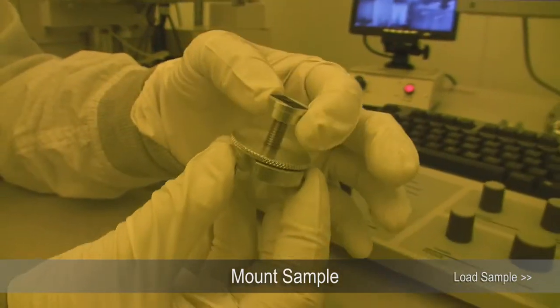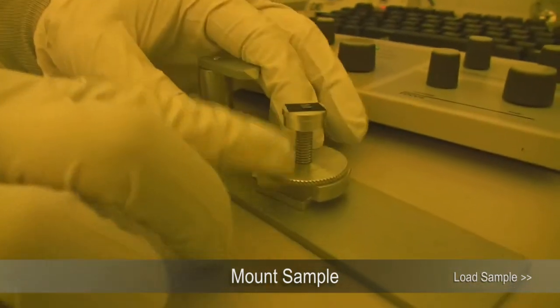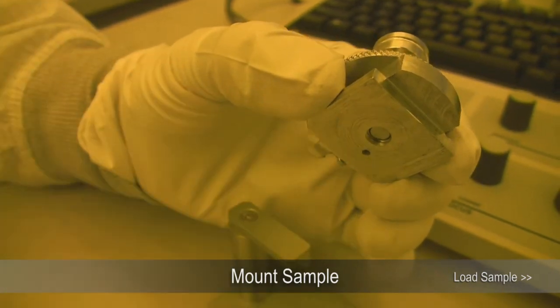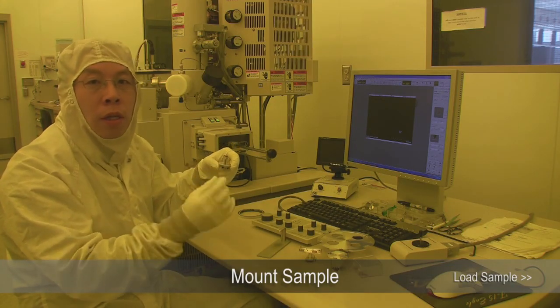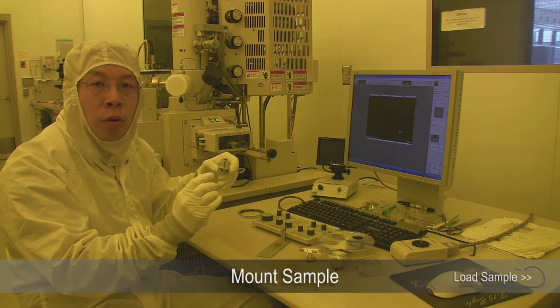So you loosen this set screw and then turn it back up counterclockwise — it will be very stable because it doesn't stick out. If you have a very thick sample, we have some shorter poles and you can make a special request to have those shorter poles for your thicker sample.